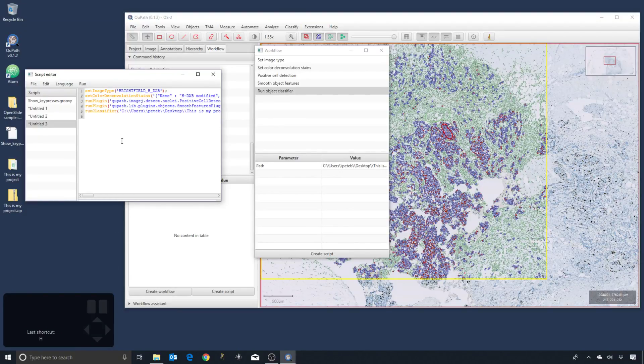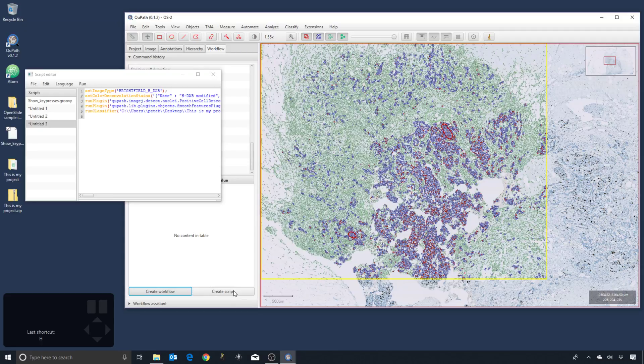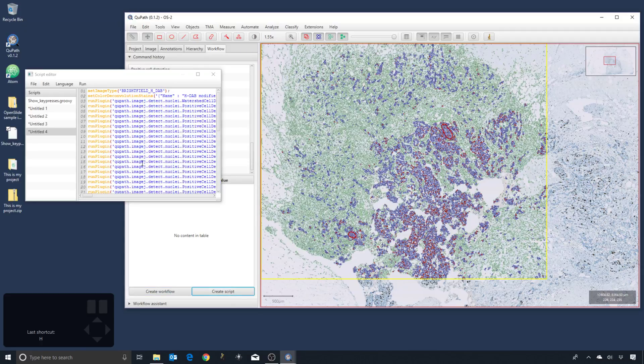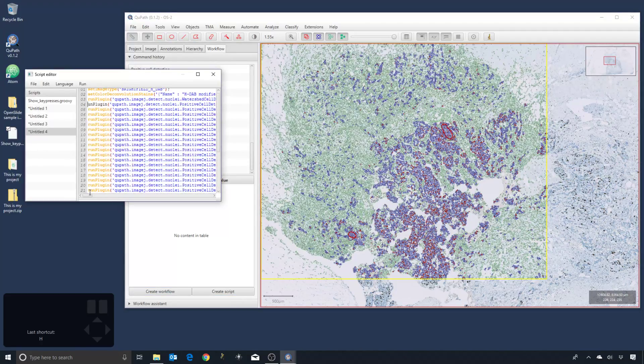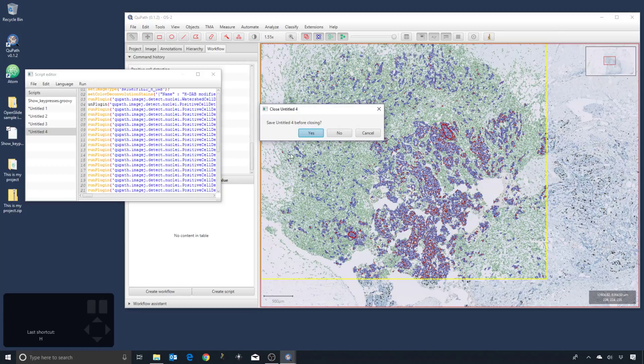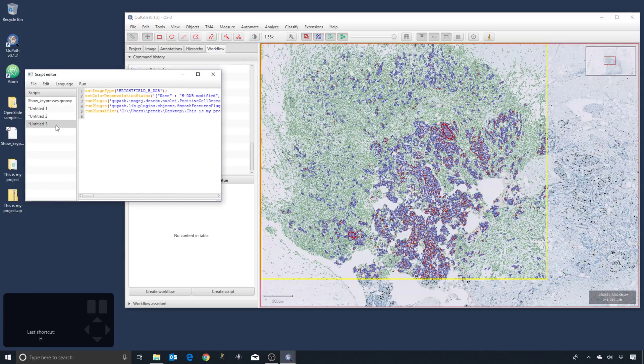And just delete the lines from in here. So it doesn't really matter which approach you take. You should end up then with a script which is relatively clean. And if you have multiple images, you can say 'Run for Project'.